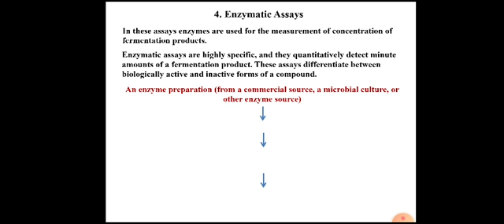The protocol begins with enzyme preparation. Enzymes can be obtained in pure form from a commercial source. They can be obtained from microbial cultures which are lysed.